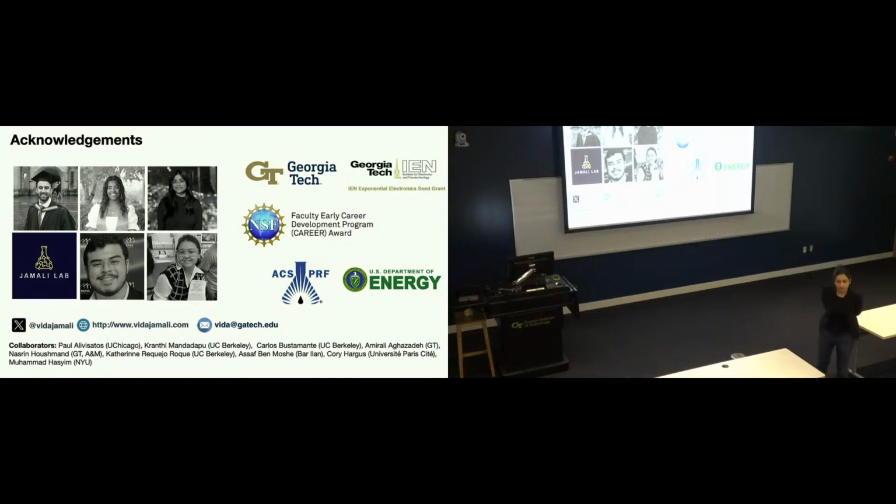As the nanoparticles are moving around, do you not have to refocus or anything? These particles that I talked about are mostly interacting with the membrane. Most of the things that we have done so far are particles that are very close to the surface, so we don't have that much of a focal plane change. The reason that we can see them with the cameras we have, which have millisecond resolution, is because they're interacting with the surface. If they move away from the surface and go into the bulk, they're going to be moving orders of magnitude faster than what you can catch with the cameras that exist today, which is the idea of the IEN proposal: can we go beyond that?